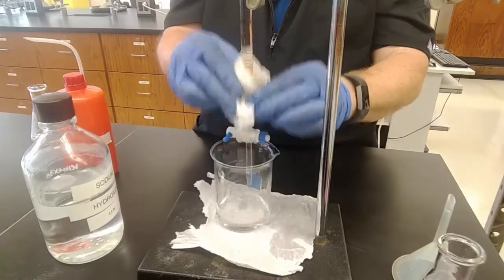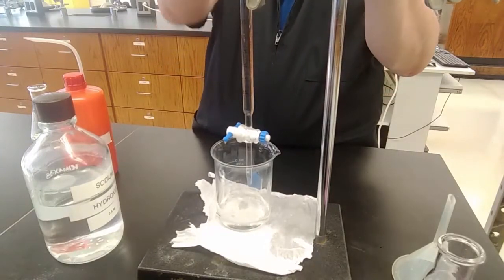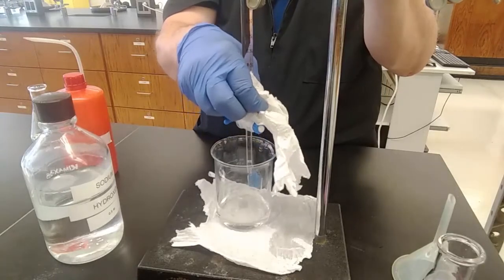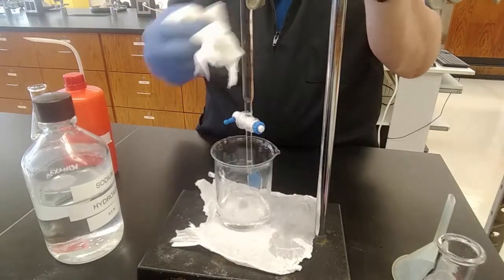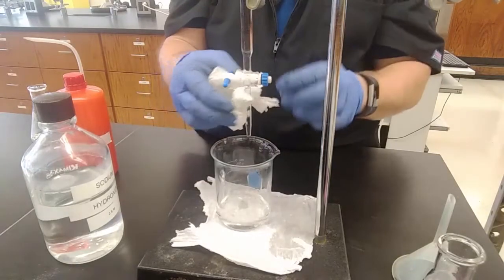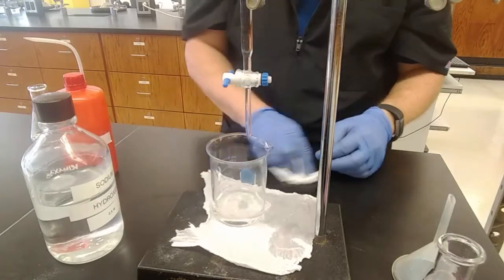Make sure there's nothing on the outside of my burette that's going to drip into my experiment. Again, I'm not wasting my time starting it at 0.00. That is an enormous waste of time. So many people say, oh, I don't want to have to subtract. And then they spend 5 minutes getting it exactly on 0.00. Just use a calculator and subtract, for crying out loud.